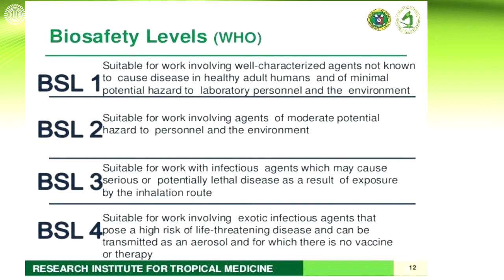So, ano ba yung mga different biosafety level? You have biosafety level 1, 2, 3, and 4. So, kapag biosafety level 1 lang, you are working with infectious agents that have known characteristics. Okay? So, this is suitable for work involving well-characterized agents not known to cause human disease in healthy adults. So, ito yung mga non-pathogenic agent naman. So, walang problema kapag non-pathogenic. Biosafety level 1 lang yan.